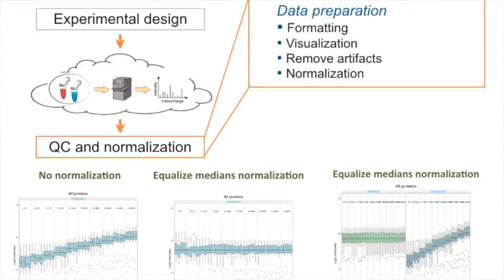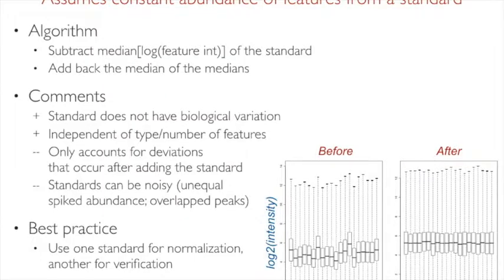If we do have labeled references, which we actually had in this case, equalizing the references really allows us to keep the biological signal, but just correct for some technological artifacts. And so the design of normalization is a very important thing, which we need to think through as part of the design before collecting the data.